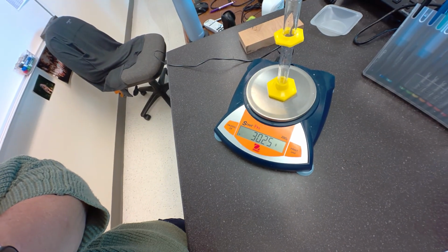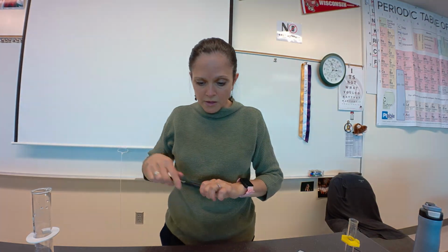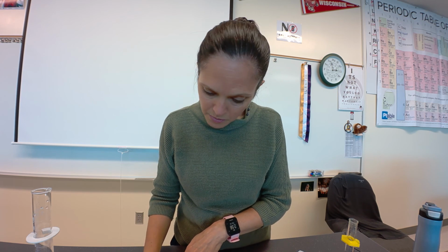So I am going to put this on the balance, and I'm going to grab the camera so that you can see what we've got. We have a balance of 30.25 grams. So we are going to write that down: 30.25.